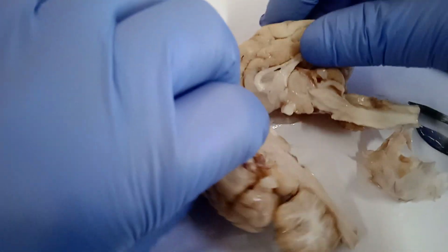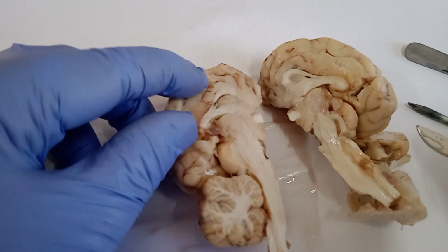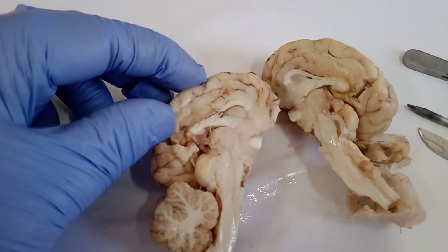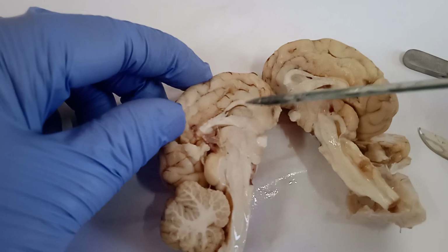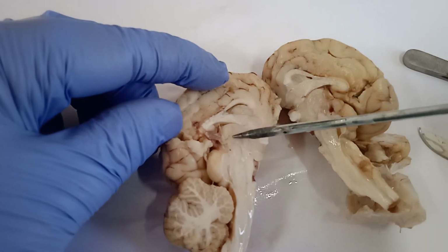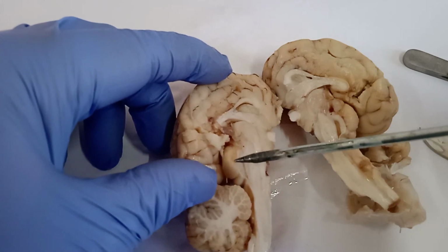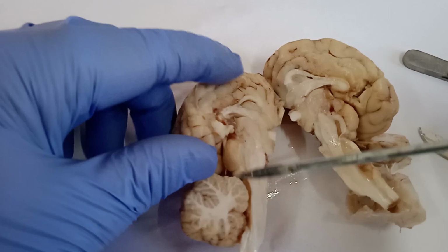So here we have given the cut into two parts, and you can see that. This is the lateral ventricle, and this is the thalamus. This is that part of the superior colliculi. This is the inferior colliculi.